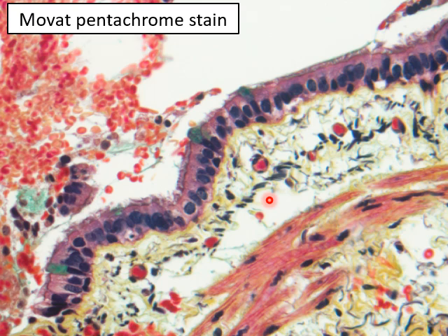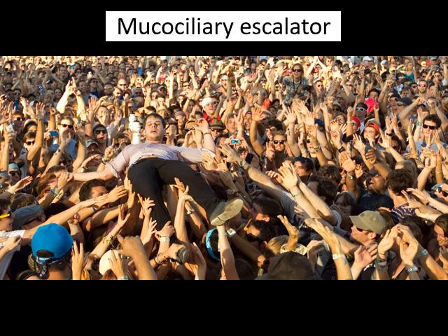The Movat pentachrome stain also shows the smooth muscle layer separating the mucosa above from the submucosa below. The mucociliary escalator is an important concept: cilia beat in unison in one direction, carrying dust particles and debris up and out of the lung — opposite to the direction of incoming airflow. Material is carried up to eventually be swallowed or expelled.